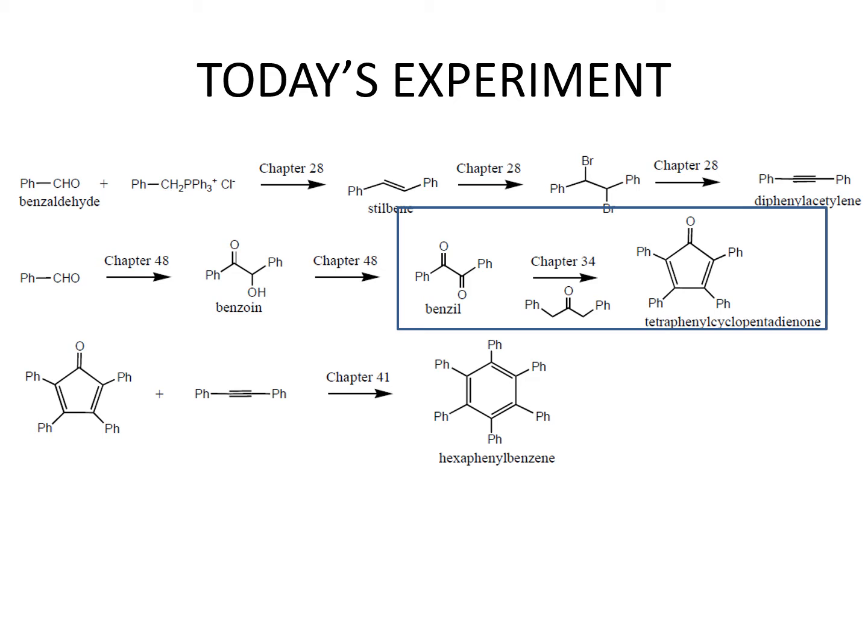And specifically, in previous week's experiment, we synthesized benzoin from benzaldehyde, and then benzil from benzoin. And this week we'll look at synthesis of tetraphenylcyclopentadienone from benzil and 1,3-diphenylpropanone.